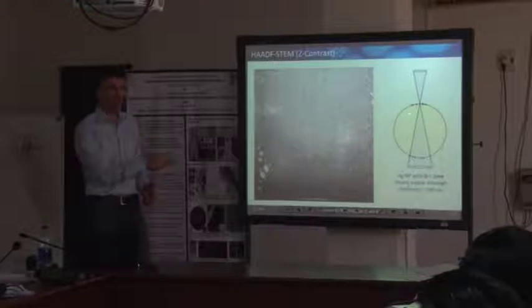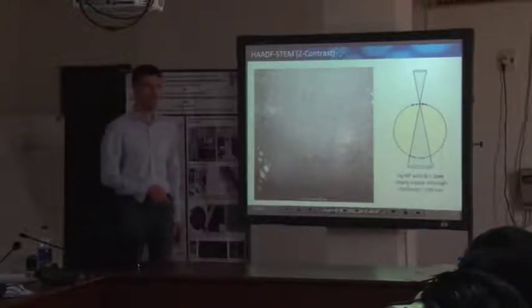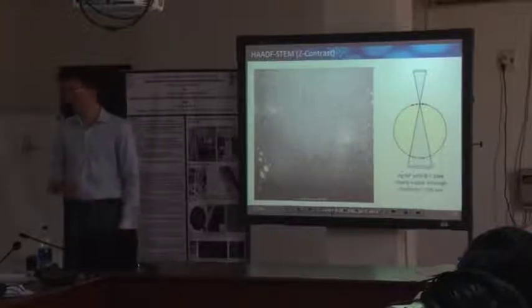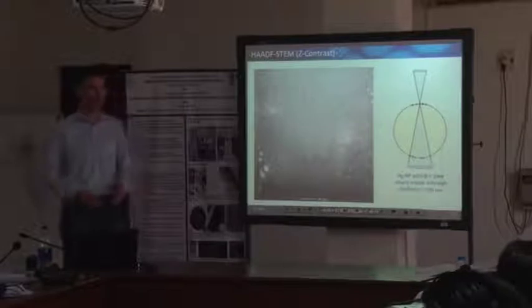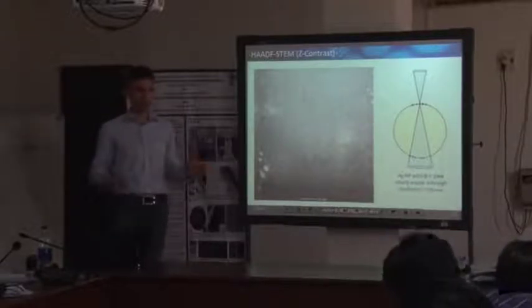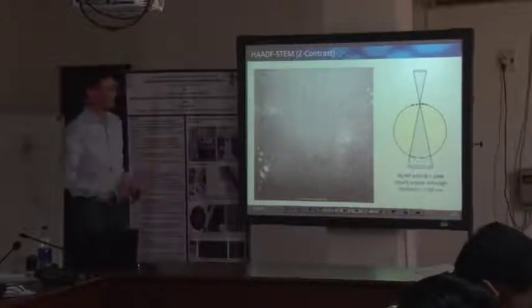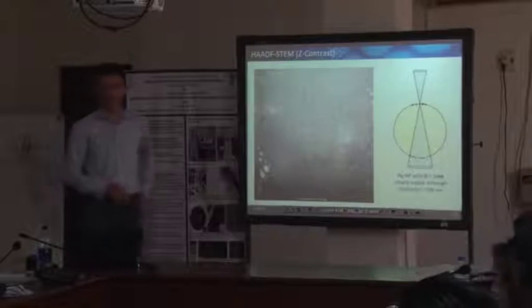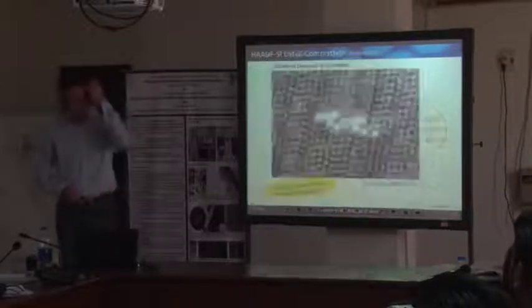Those particles are only a few nanometers in size, and you see all of them on the surface of these silica spheres, which you would never be able to do by just conventional TEM imaging, because you would end up with Fresnel contrast and the superposition of all these contrast features. You would not be able to distinguish all these small decorating particles. So there are different benefits of doing STEM imaging.